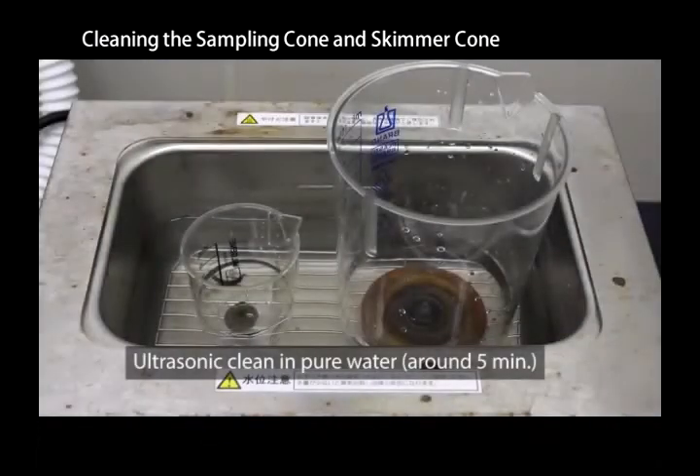Use an ultrasonic bath to clean the cones in pure water for about five minutes. Do not over-sonicate the cones. Do not sonicate the sampling cone and skimmer cone together in the same beaker at the same time. The copper of the sampling cone will transfer to the skimmer due to galvanic reaction.